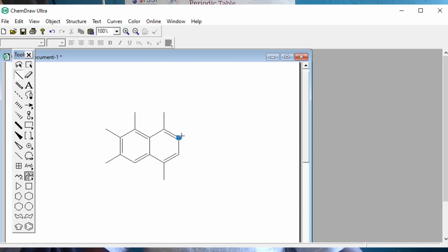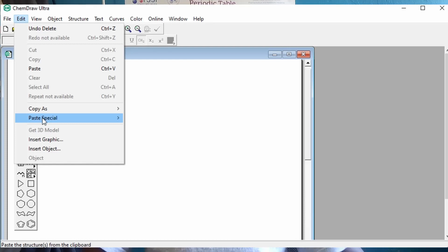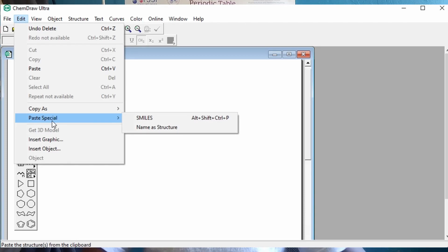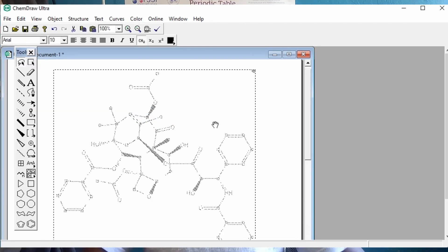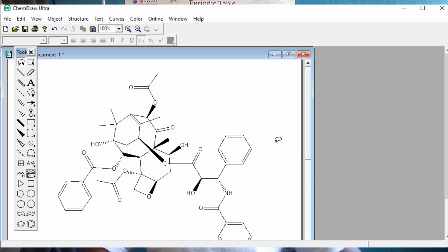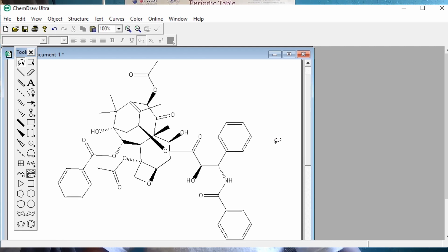They are important to a biologist, a biochemist, a chemist. So in this short method, it will take us just seconds to generate very complex structures like Taxol. Let's delve into it.